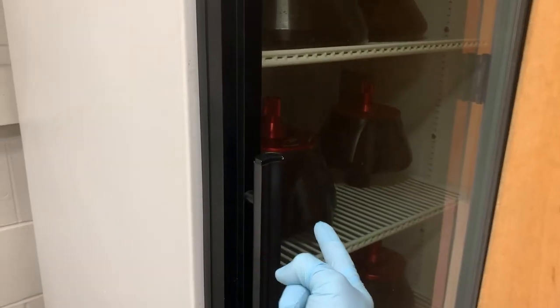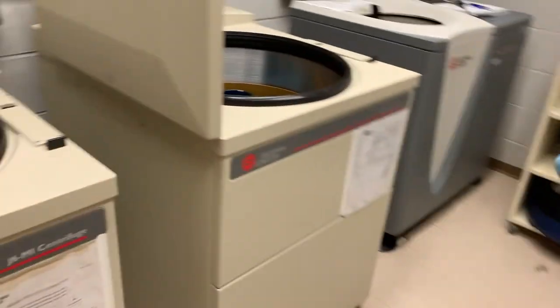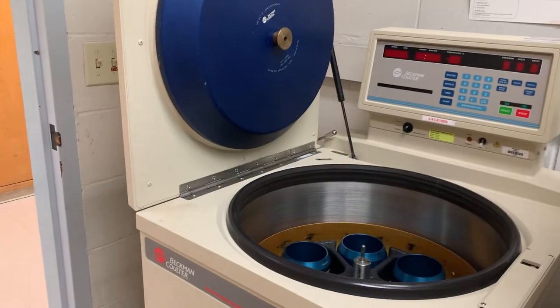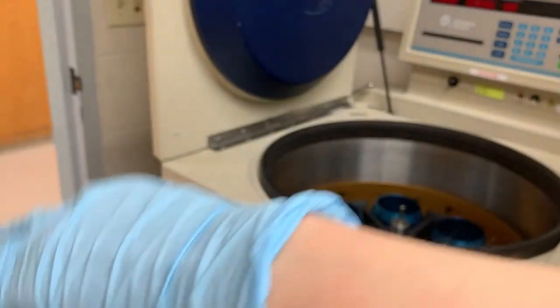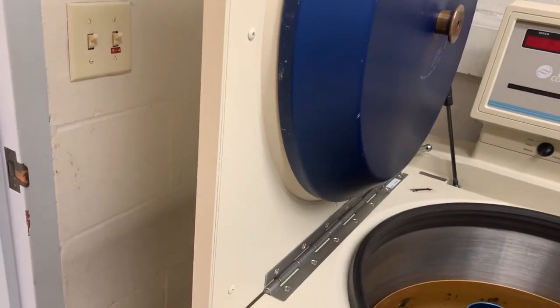One thing I forgot to mention about centrifuges: we keep the fixed angle rotors in the fridge so they're already cooled and we don't have to pre-cool them for the big centrifuges. When you're not using the centrifuge, keep it open but off. If you keep it open but on, it will try to maintain its set temperature — like 4 degrees Celsius — causing condensation and wasting energy.